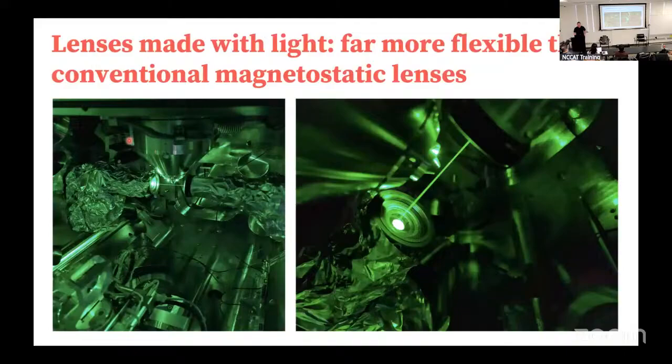So this is what it looks like. The great thing about that chassis is that the shelf, when you open it up, I can put my head inside the entire chamber. It's that big. And so in so doing, you can actually put a lot of optics inside the chamber. So actually our green laser is coming in from this direction here. It's then going up through a periscope.